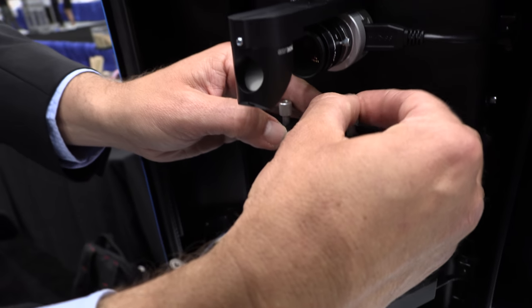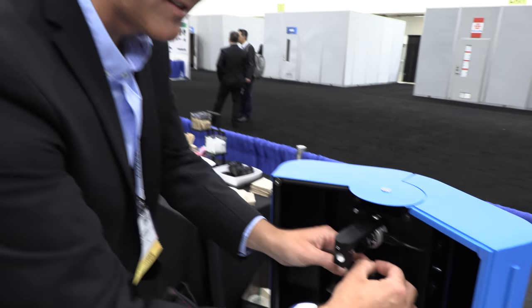So who would be using this? We have customers in the OLED industry, the big players from Korea, in Japan, in China and everywhere in the world. So how do they put their samples in there?